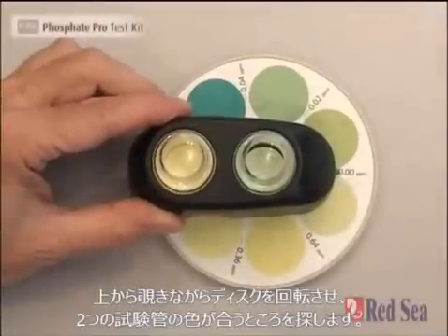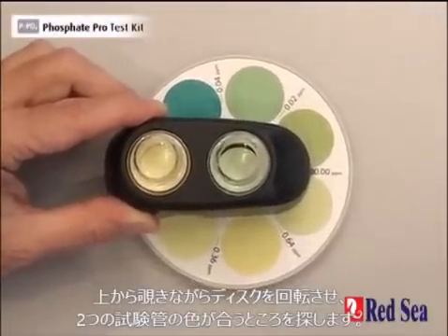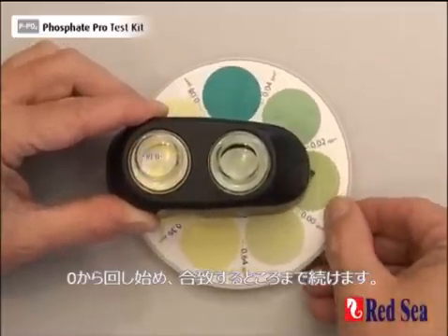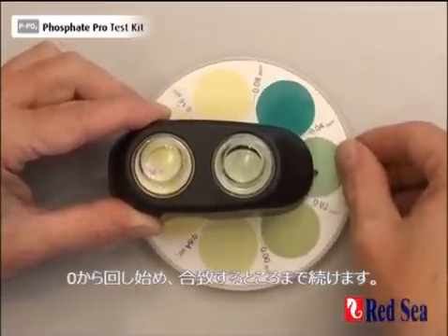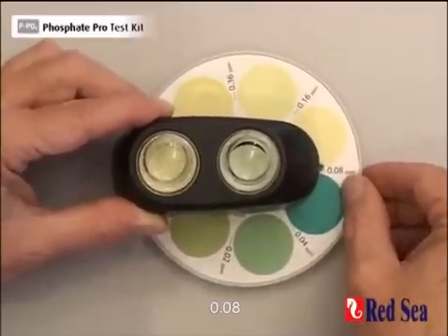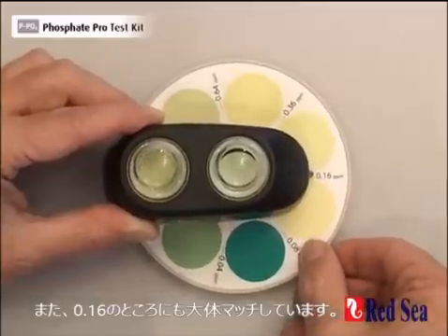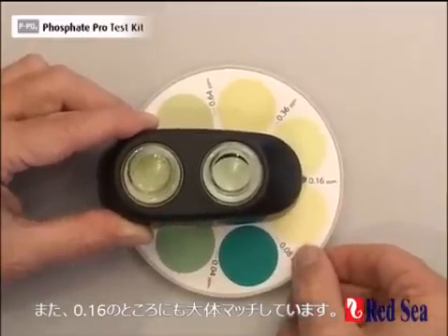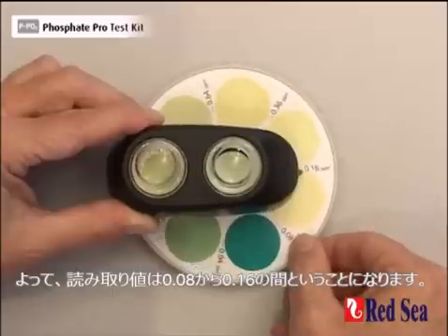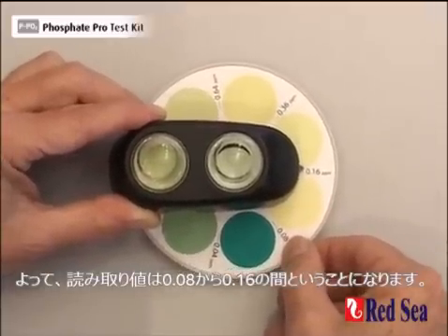Now looking from above, we rotate the disc until we get a color match between the two vials. Starting from 0, we move around and we see that when we reach 0.08, we have got almost a match, and 0.16 is also almost a match. Therefore our actual reading is probably somewhere in between 0.08 and 0.16.